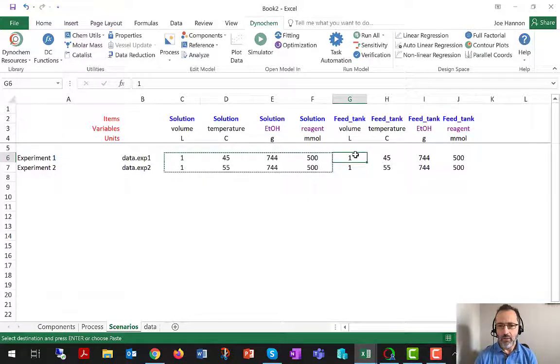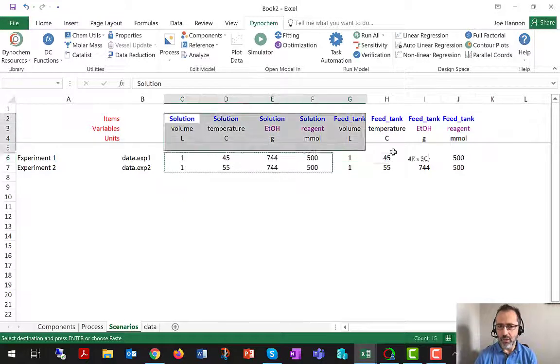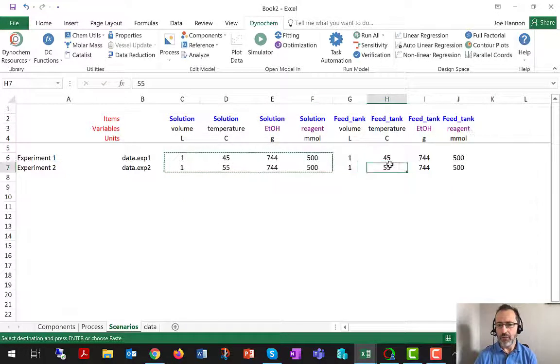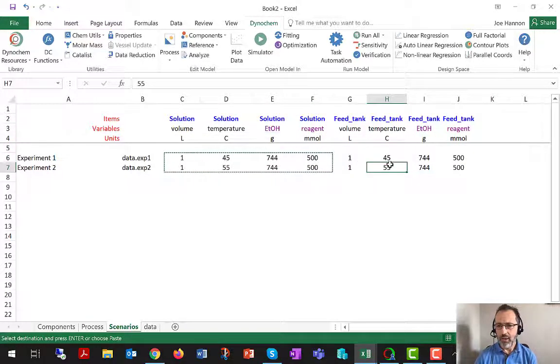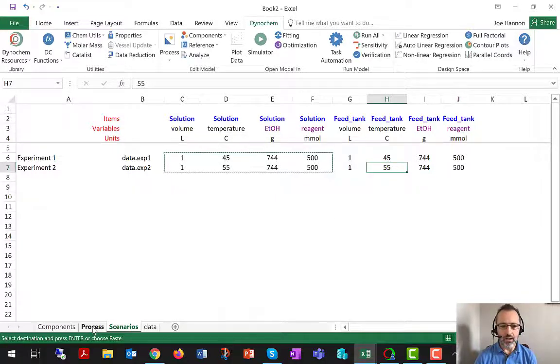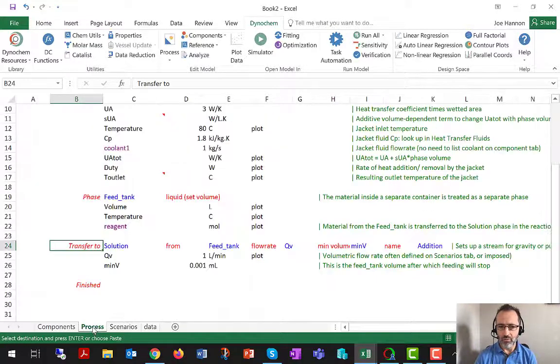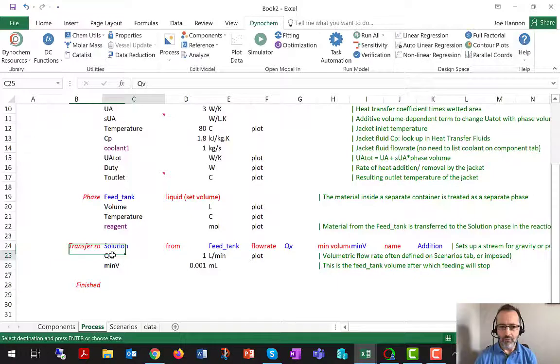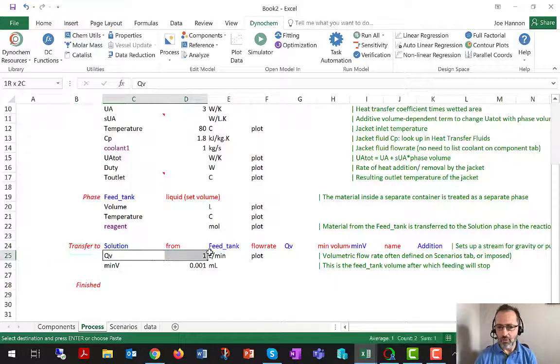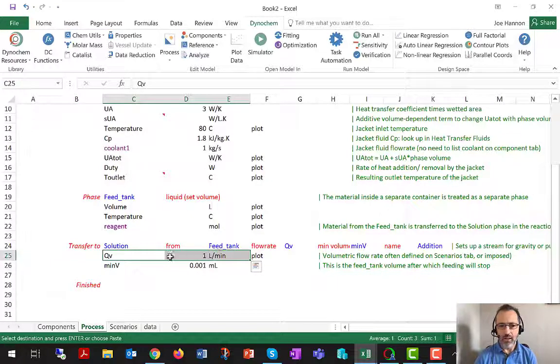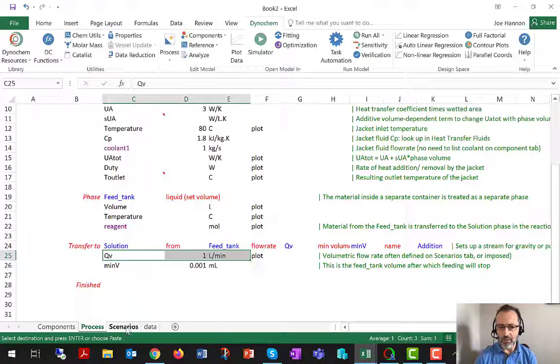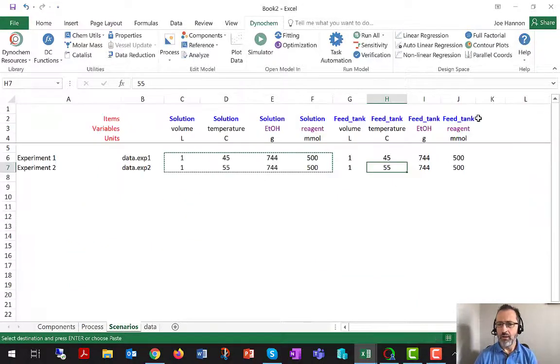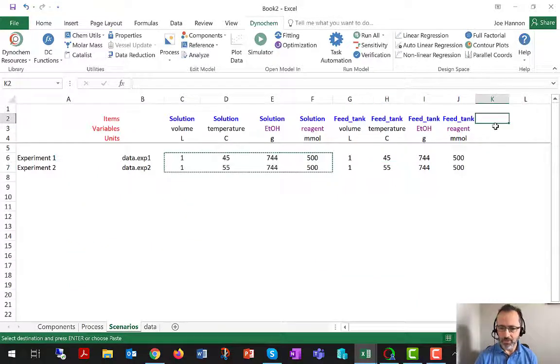And that then gives good initial values for both the feed tank and the main vessel. And there's one more piece that I need in order to make things happen, and that is the volumetric flow rate.